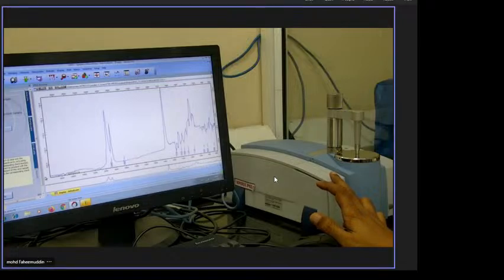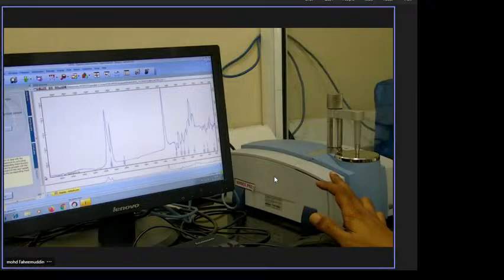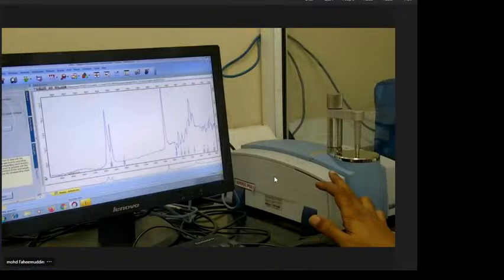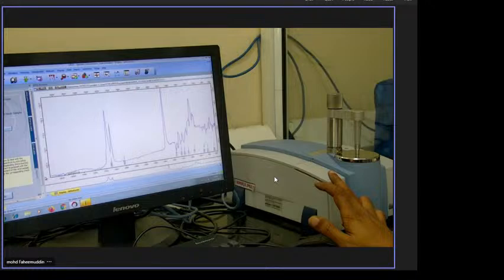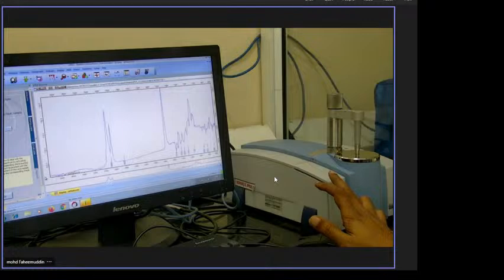They are also using atom probe. Atom probe has a different application, and it also costs 30 crores per instrument. These kinds of instruments are exclusively helpful for R&D when you are developing a new molecule. Once somebody has developed a molecule, they give the procedures and we manufacture. In India, all pharma companies are doing the manufacturing process. All methods are already established.